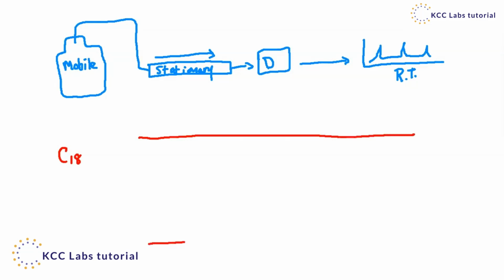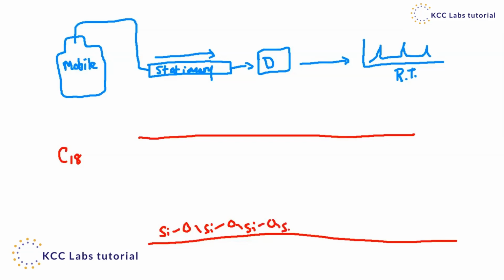Now, a lot of times when we do wet bench, desktop chromatography, we use silica gel or alumina. So you have this as the base, and then once you have your silica gel, you can adhere other types of organic material to the side.